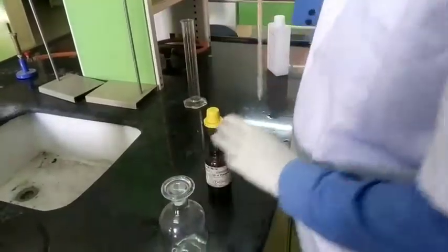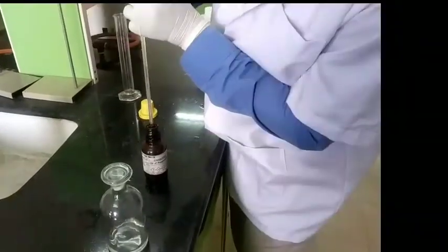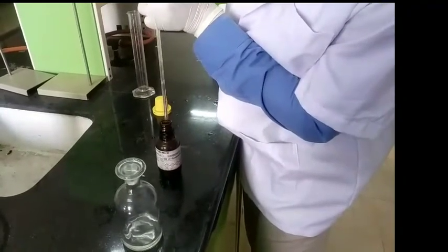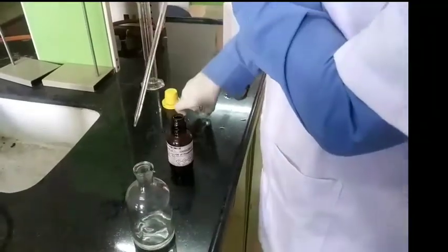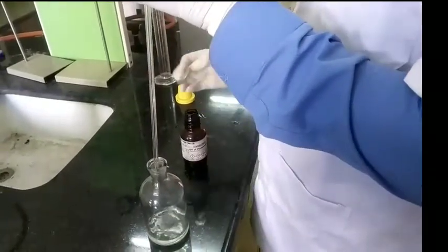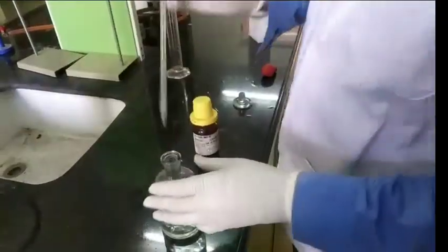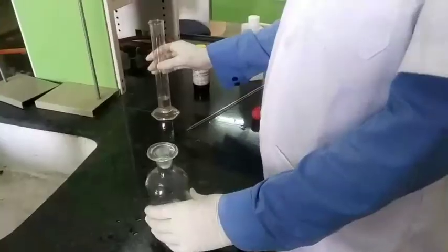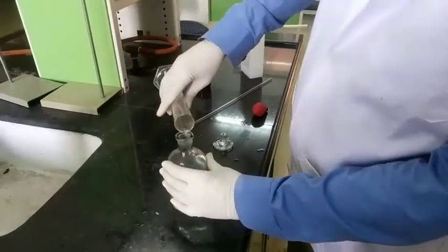Now let's take 1 ml of peppermint oil. So here we have taken 1 ml of peppermint oil. Now we will add 19 ml of purified water into our preparation.